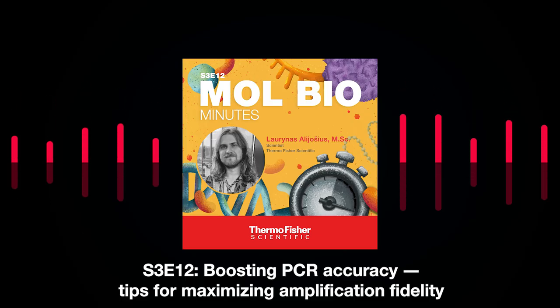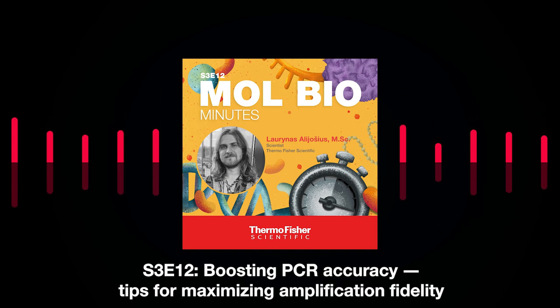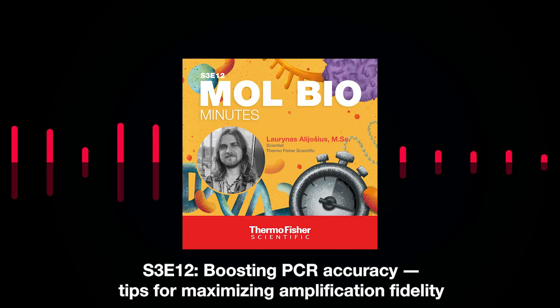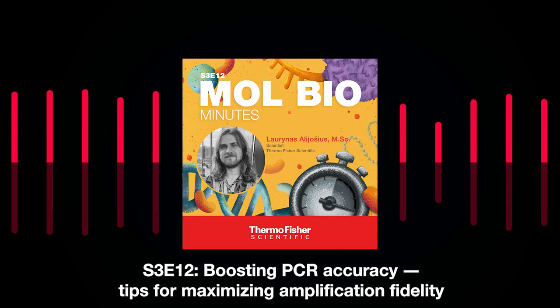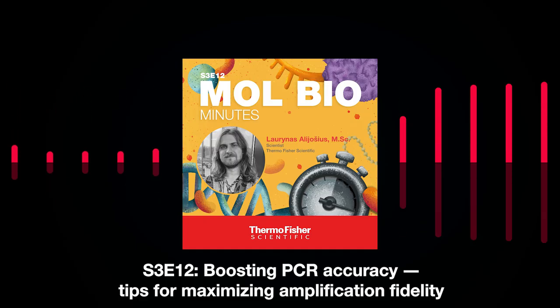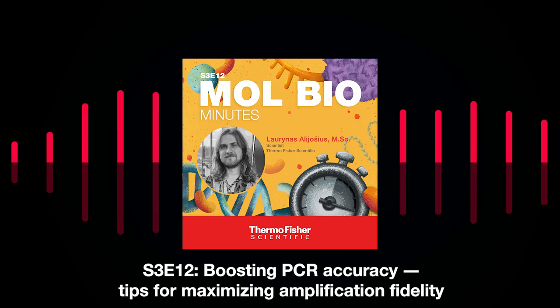Let's go back to the PCR components. So what about the other components? If we're talking about other components rather than the DNA polymerase, we want to have the highest quality possible for the highest PCR accuracy. Always follow guidelines such as primer design recommendations to have the best primers for your PCR.